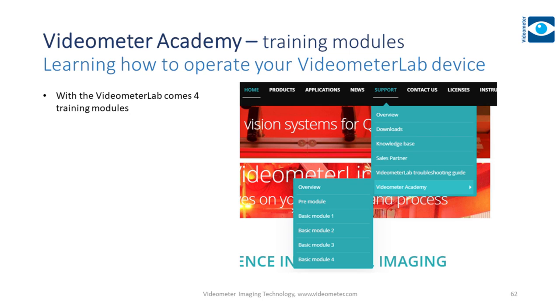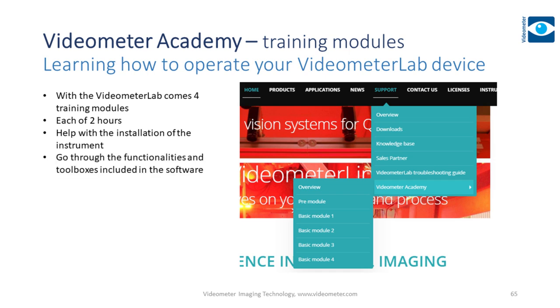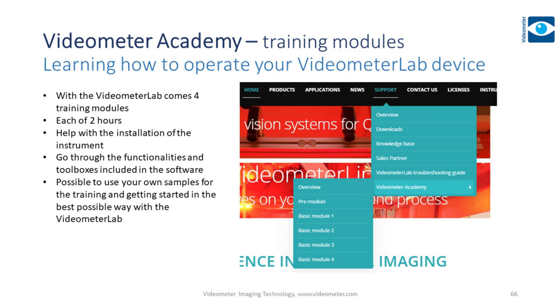When you have received your Videometer Lab, you are ready to start the 4 Videometer Academy training modules. The training modules will teach you how to set up and operate the Videometer Lab device and software. There are 4 training modules, each of 2 hours. If needed, help with setting up the instrument will be provided during the first training module. After the installation, the training modules will go through the functionalities and toolboxes included in your instrument license. For the modules, you are more than welcome to bring and use your own samples for the training.